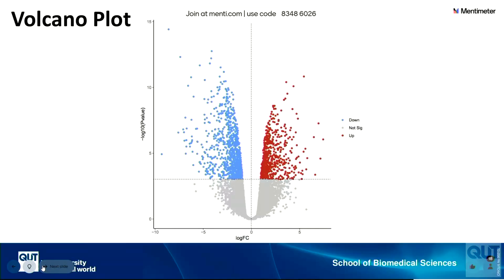So then you take your negative log of your p-value and you make it your x-axis. So as it's more significant, the sample gets higher. And then you take your log of your fold change, your log FC, and you make it your x-axis. Sorry, I might have said that the wrong way. Your y-axis. Thank you. So your negative log p-value is your y-axis.